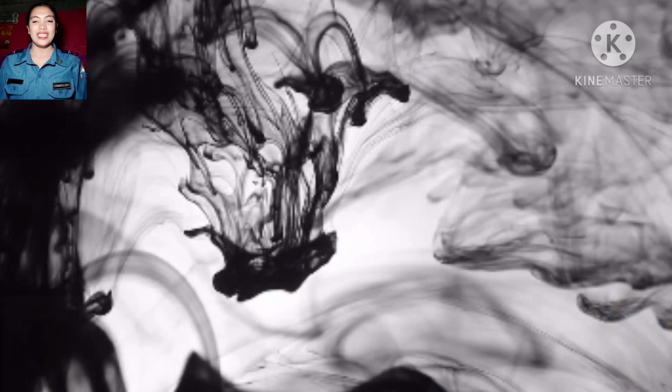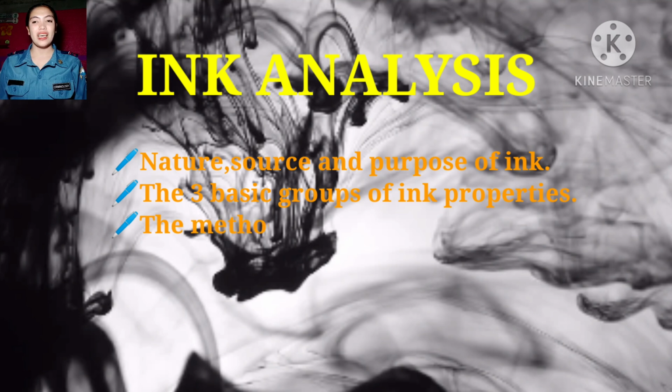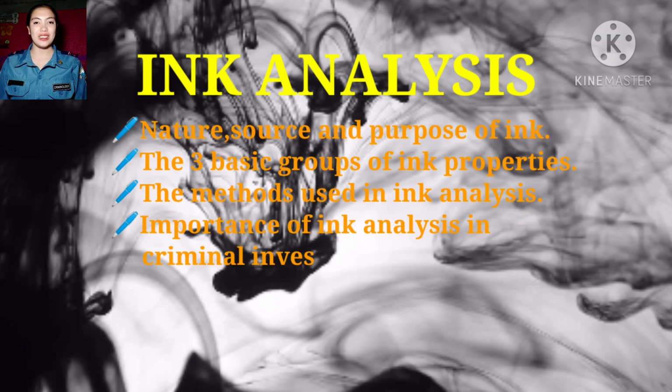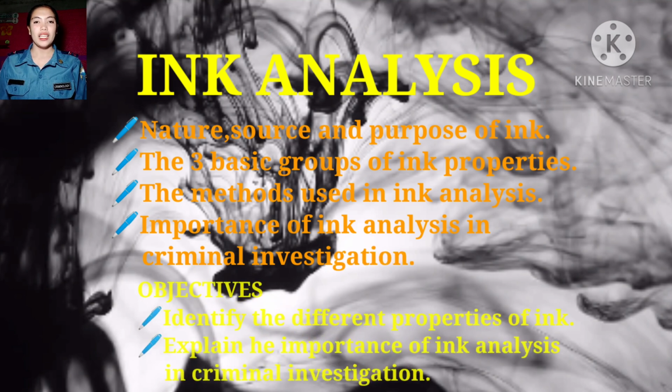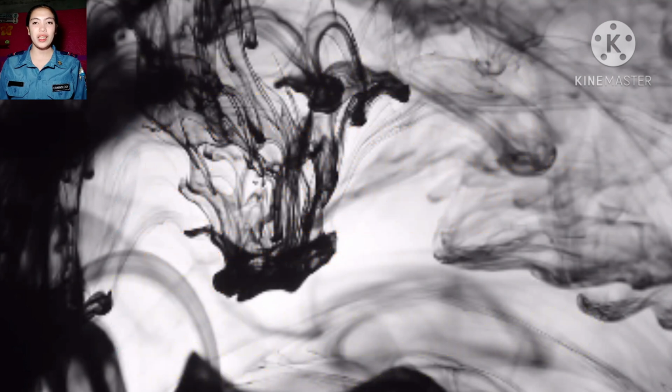This is entitled Ink Analysis, which is the final laboratory exercise wherein I will discuss the nature, source, and purpose of ink, the three basic groups of ink properties, the methods used in ink analysis, and the importance of ink analysis in criminal investigation. The objectives I should meet are to identify the different properties of ink and explain the importance of ink analysis in criminal investigation. So, let's start with the ink and its nature, sources, and purposes.